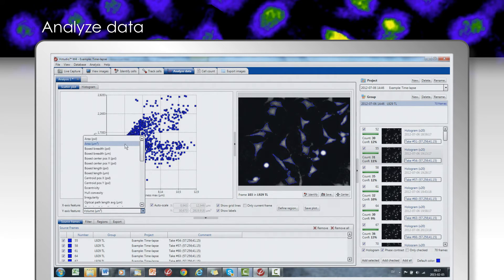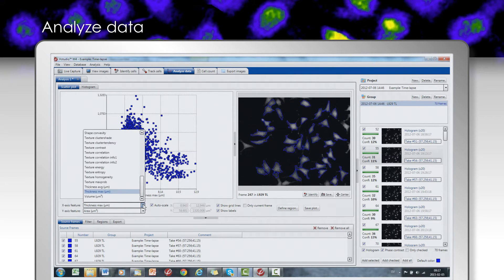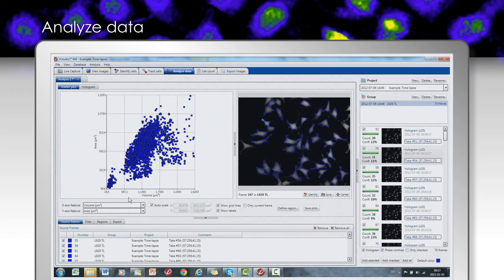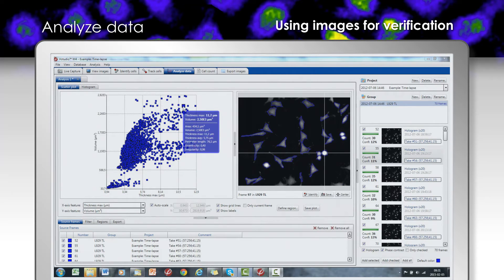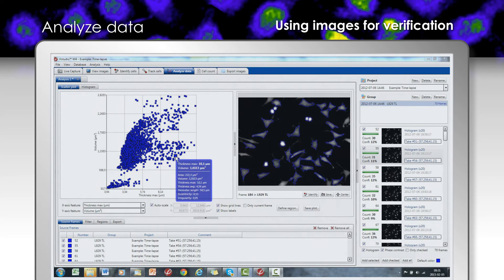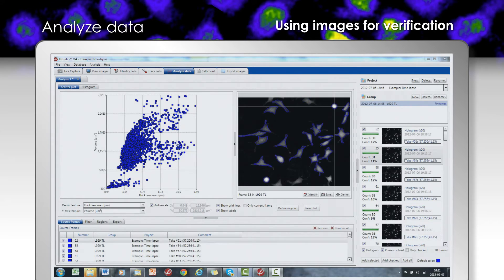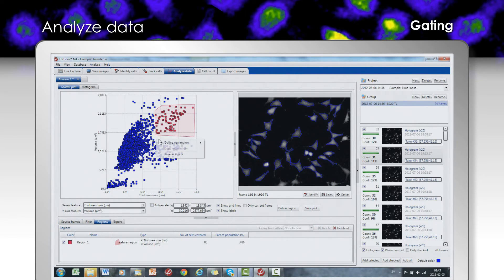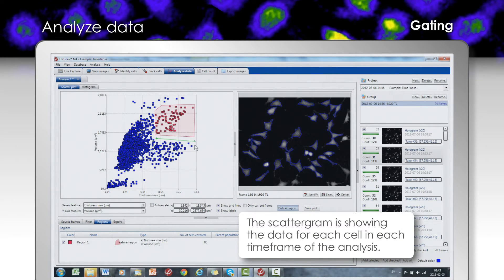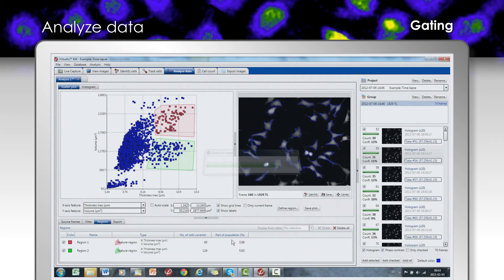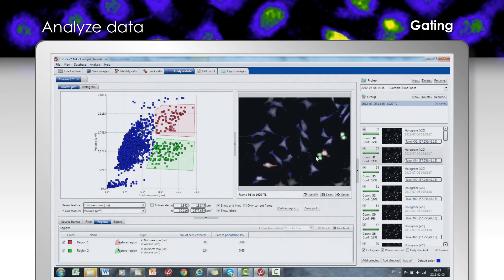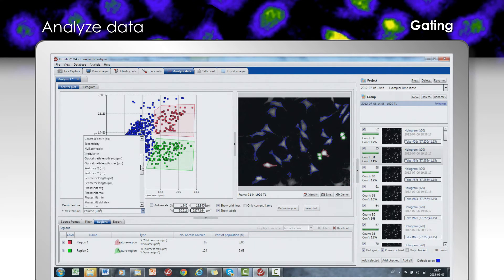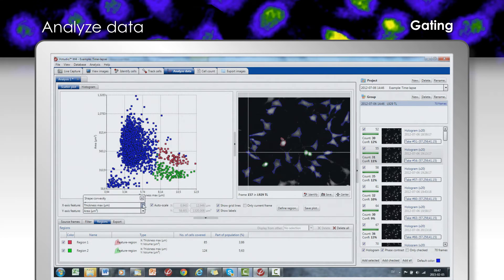Further, comprehensive automated analysis is performed automatically, with options to display quantitative and morphometric features in two-dimensional histograms and scattergrams. Data verification is done based on images — as we point to an event in the scattergram, the frame that contains the event is displayed. The crosshairs identify the specific events; in this example, mitotic cells and post-mitotic cells. Corresponding quantitative parameters are simultaneously displayed in the insert. Cells of interest can be gated and color-coded: the red region is defined around mitotic cells and the green region around post-mitotic cells. Cells from the regions are color-coded in the images, and once the regions are color-coded in a scattergram, the colors are carried through for all events in the region and to all scattergrams.